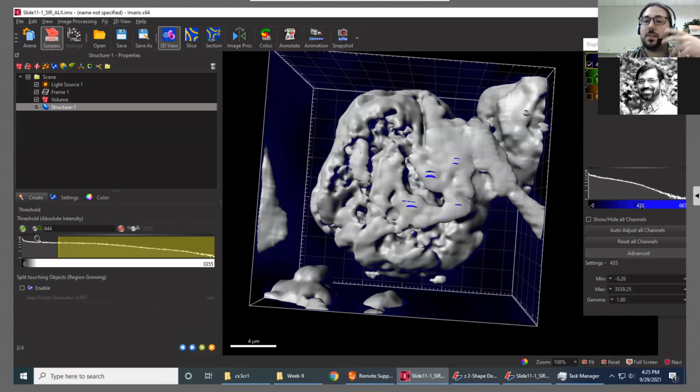Very smooth surfaces with very high resolutions will require a lot more computational time to render and analyze and calculate the statistics for than rougher surfaces. So finding a good balance between fidelity and roughness depends on what you're analyzing and what you're trying to get out of it.